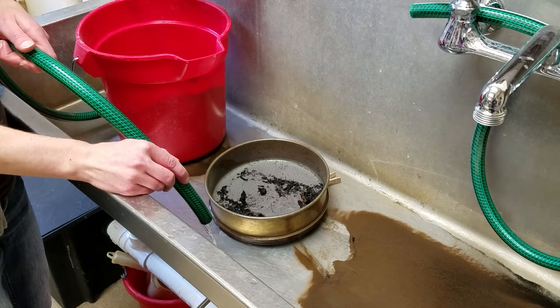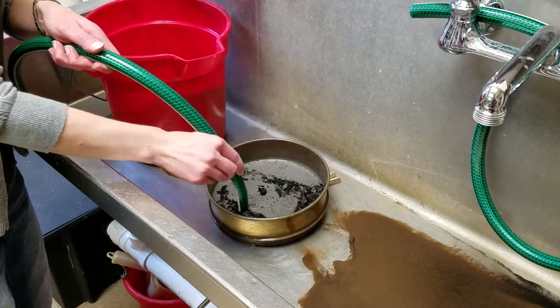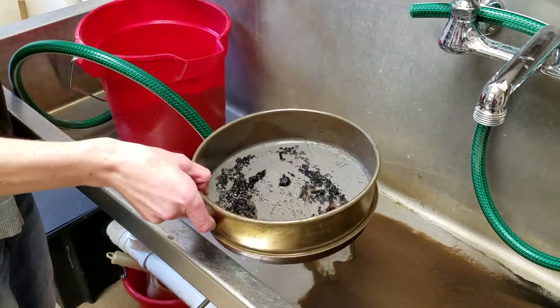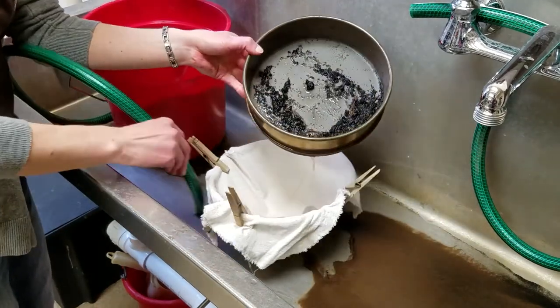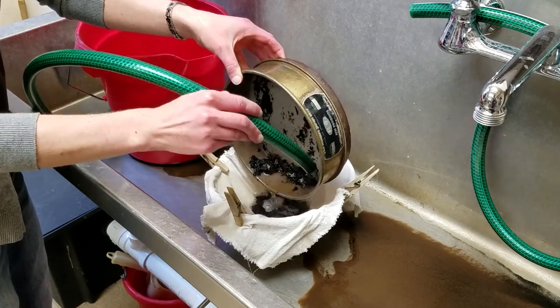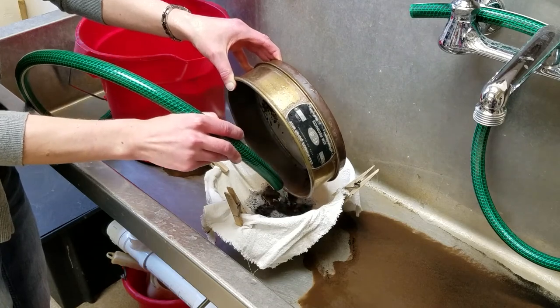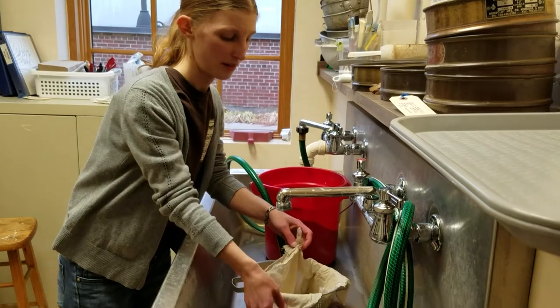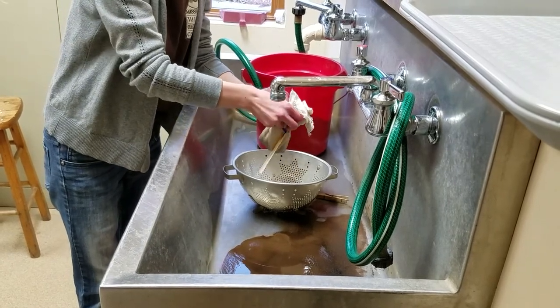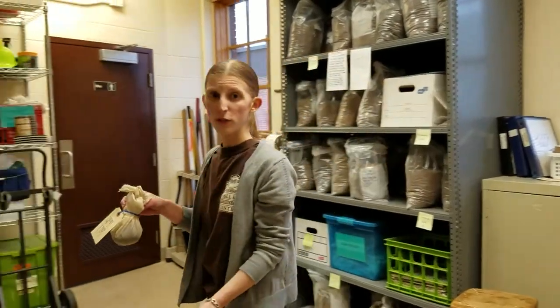Once we pour the light fraction into the screen, we need to transfer it to the muslin for drying. Gently rinsing the light fraction helps remove any foam that could cause the fragments to stick together as they dry. Then we carefully wash the light fraction into the muslin, making sure to reach every part of the screen. When that's done, we rinse out and brush the screen so it will be clean for the next sample. Next, we carefully bundle up the ends of the muslin and tie them together with the twist tie and tag we prepared earlier, then set the sample on a rack to dry, usually for at least 24 hours.